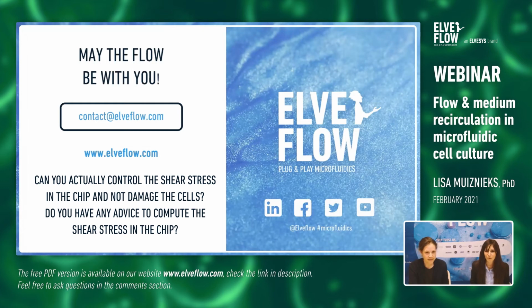Guys, feel free to use our calculator for playing with the pressures, flow rates, and shear stress. It will be really useful to design your microfluidic setup. Of course, if you use less flow rate and less pressure, you'll have less shear stress. You can change the dimensions of your chip as well to play around with different shear stress on your cells. Yeah, that's true.